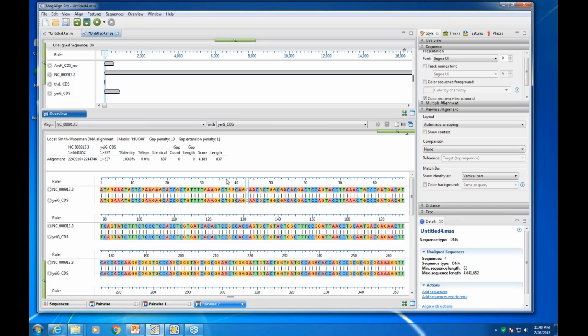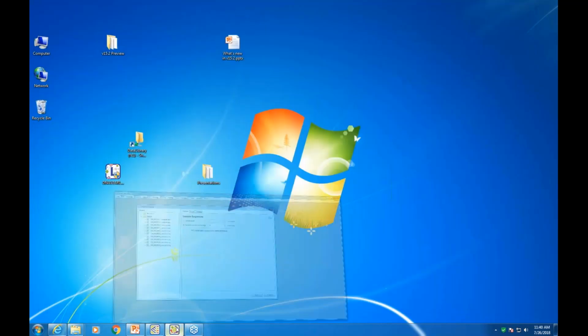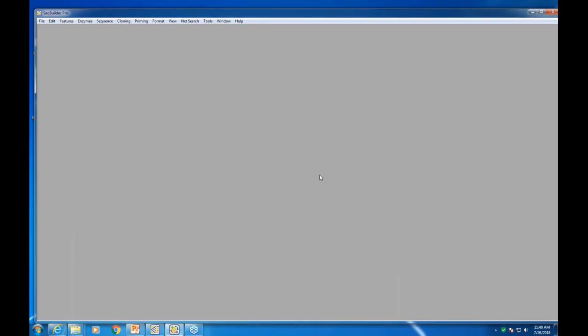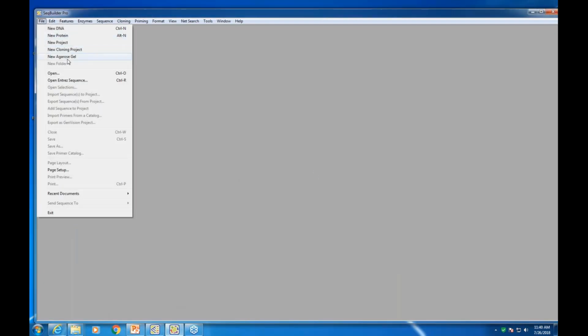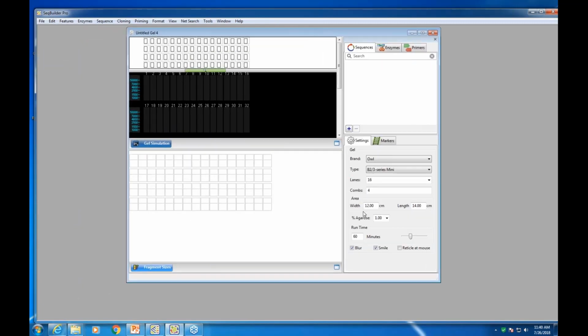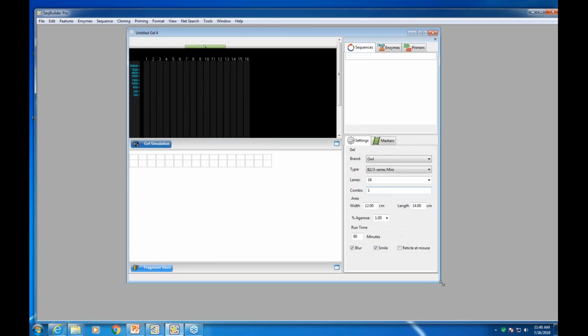Thanks, Matt. So for the next question, you're going to have to get SeqBuilder Pro back up. That question is, can I create custom molecular weight markers? I think that's regarding the agarose gel simulation. Yep, I can do that. So I will. Okay, so let's go back to one column.